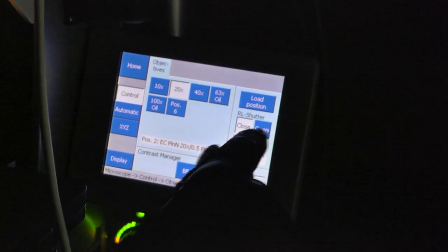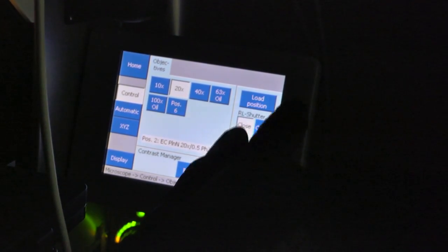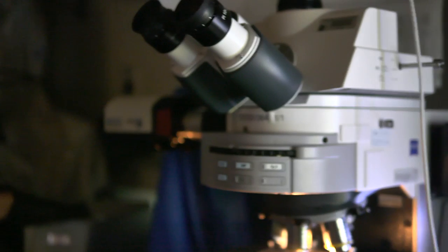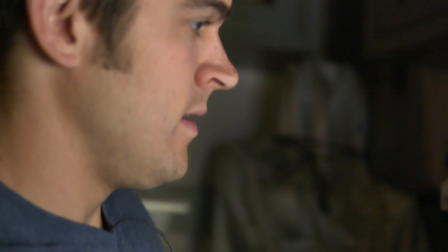So that basically turns completely dark until I change the shutters here, which will redirect the light source. So I'm going to just swap these shutters, which is basically sending different wavelengths of light. And then the filter set on the microscope will filter out everything except for that which will excite the GFP. And anything expressing GFP will show up bright green on here and everything else won't. So we'll really be able to, by switching from bright field to dark field, we'll really be able to show the contrast between those successful transformants and the cells that are not transformed because they won't glow.